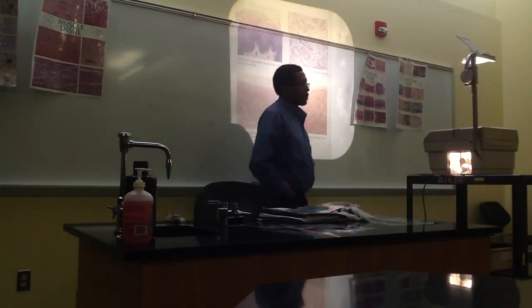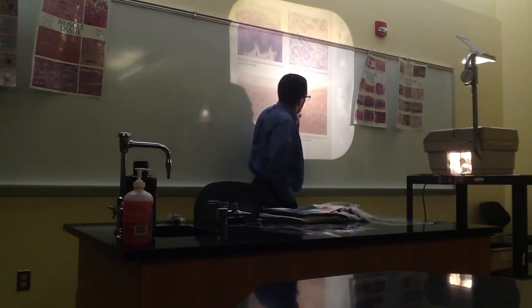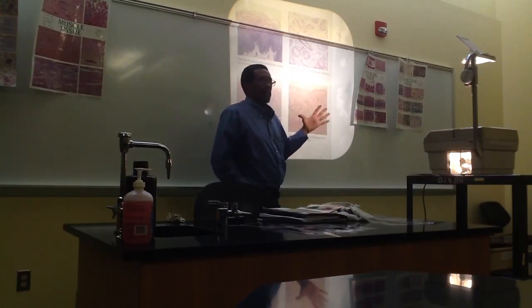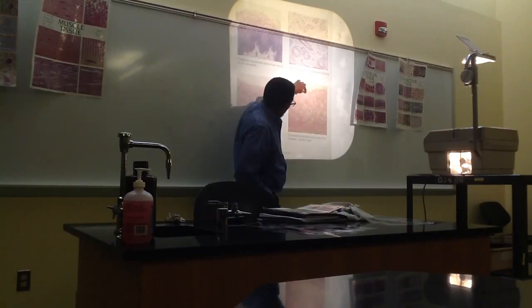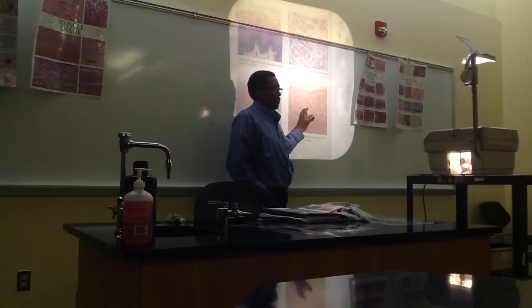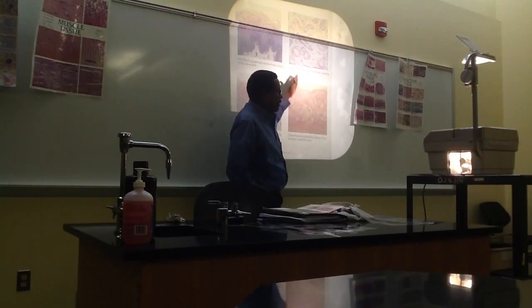Question? Why did you say we're not gonna use cell layers to identify that cell? Because I happen to know that this is transitional, but you would analyze that, you would think about that. Okay, and it does look like these touch the basement membrane. Maybe like this, it's so hard, we would have to depend on what the experts tell us, just like we would with true pseudo-stratified tissue. Okay, but you're right, you would look for the number of layers.